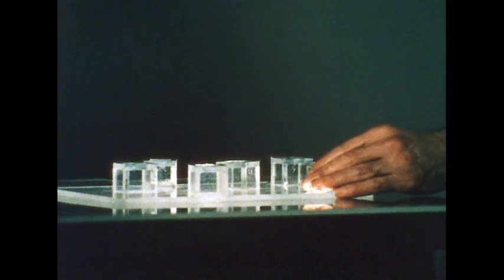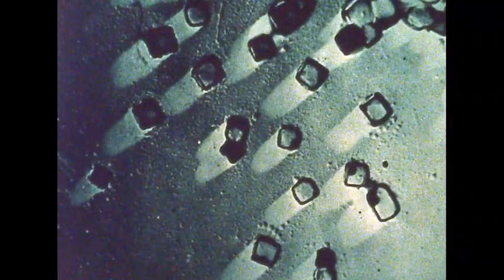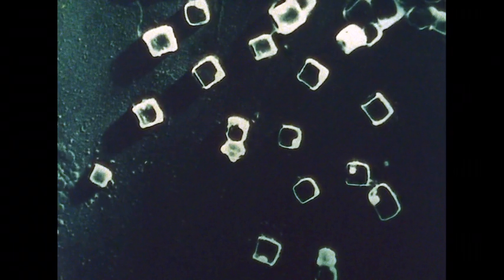This enlarged model of the cast shows how the problem has been solved. The cast is shadowed with a heavy metal, such as platinum or gold. With an actual specimen, this is done in a vacuum. The resulting electron micrograph is reversed to make the shadows black.